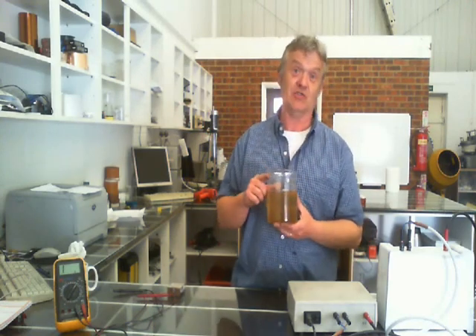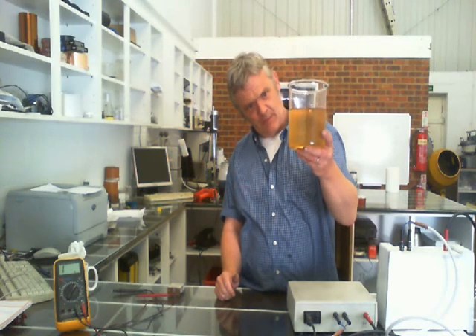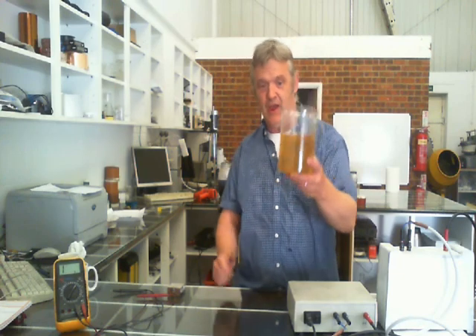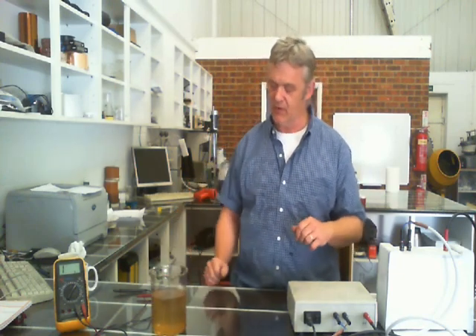What I've got this time is some of this stuff. This is our graphene oxide in solution, and you can see from the colour of it there's about half a gram per litre in there, so it's a very weak solution. It is actually 0.5 grams per litre, so it's a very weak solution of graphene oxide.